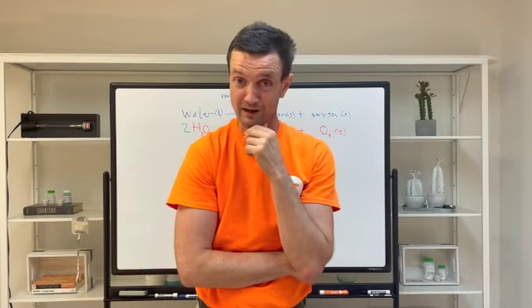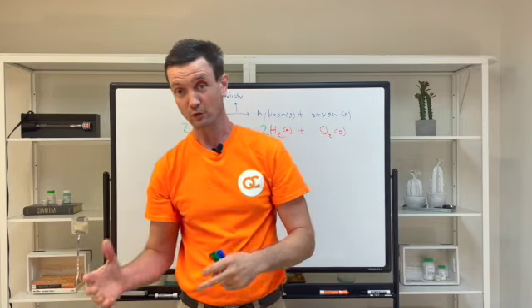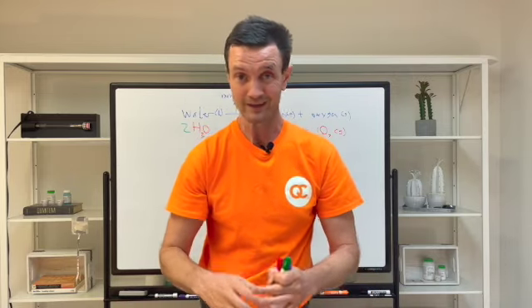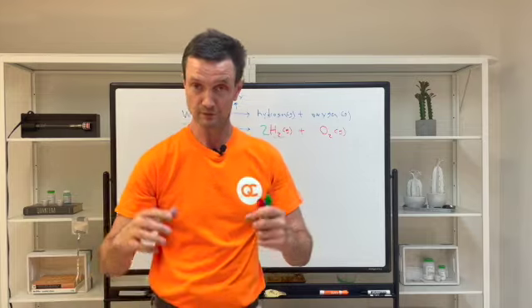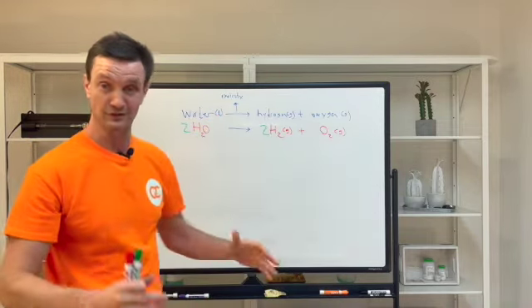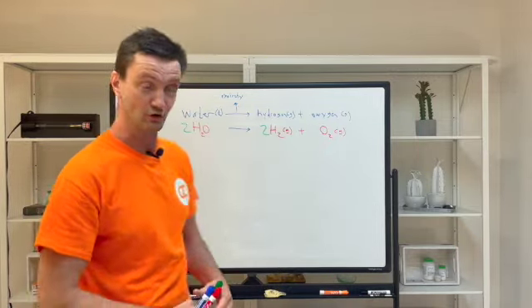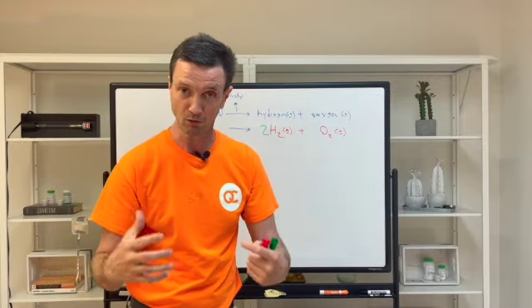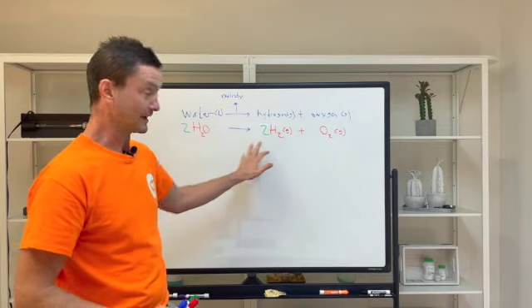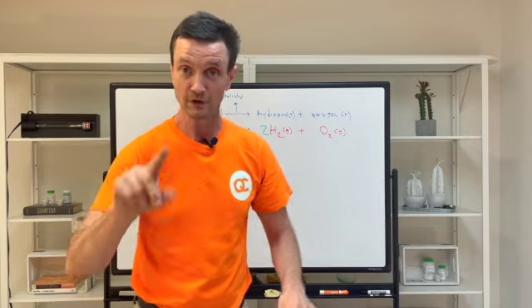So this may not have been a big surprise or big finding, but recall that there were 2 hurdles that we surmounted in this one experiment, and I'm talking like historic hurdles. First, we broke apart water. In the long arc of human history, water was assumed to be a pure, unbreakable, pristine thing. We just, in one little experiment with a little 9-volt battery, blew that idea out of the water, no pun intended.